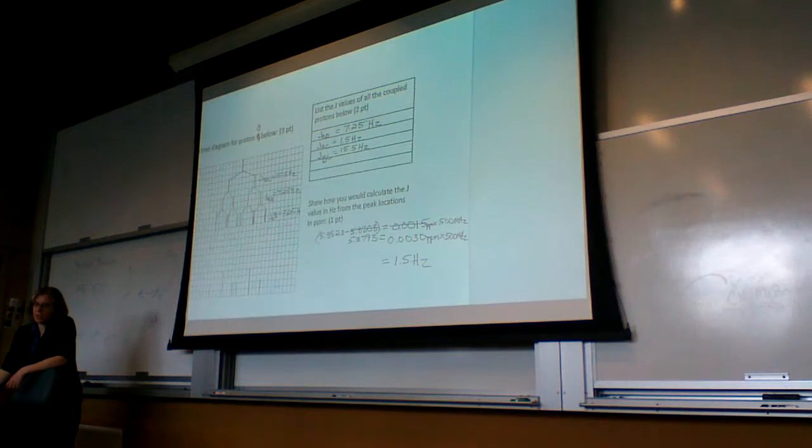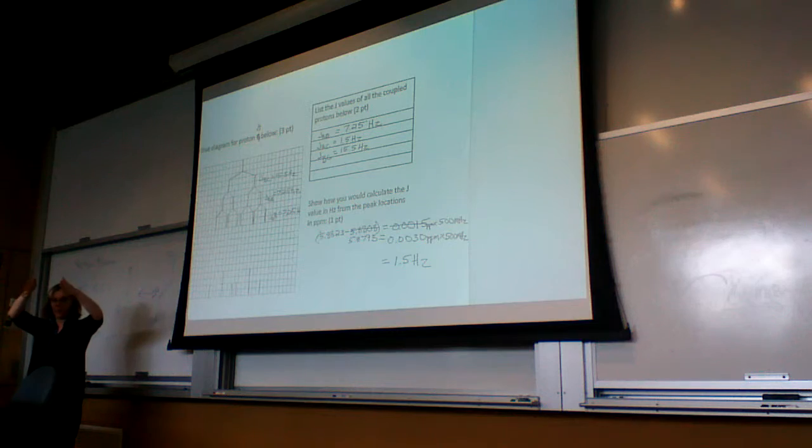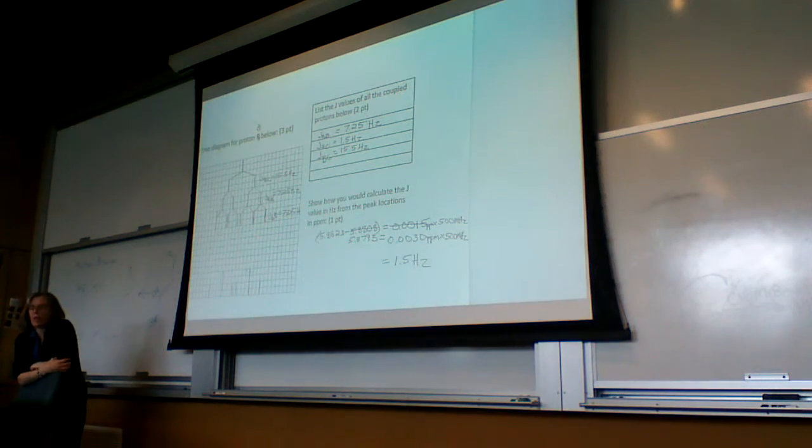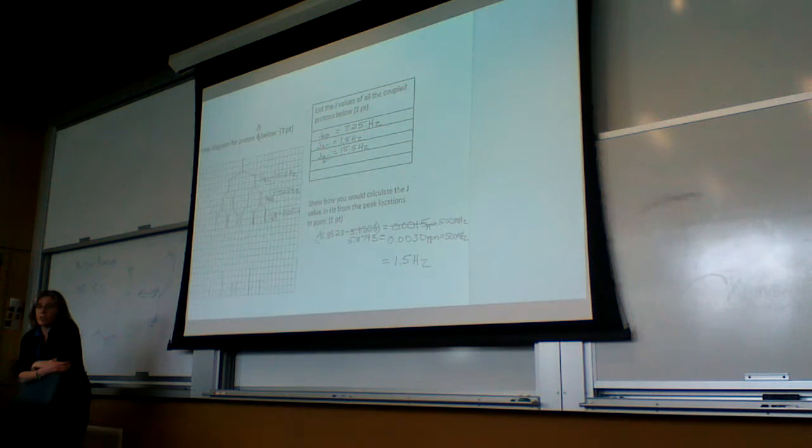And then your conversion, if you didn't use actual values, that's okay. But to convert your ppm values to hertz, you need to first subtract the ppm values of the two, so you have the distance between the two peaks, and then multiply by 500 megahertz because that's the strength of the instrument, hence the part written above, and that will give you the value in hertz. So if you don't have access to the computer to actually measure it, or if it's not shown on the spectrum that you're given, you have to actually go through and calculate those using that equation.